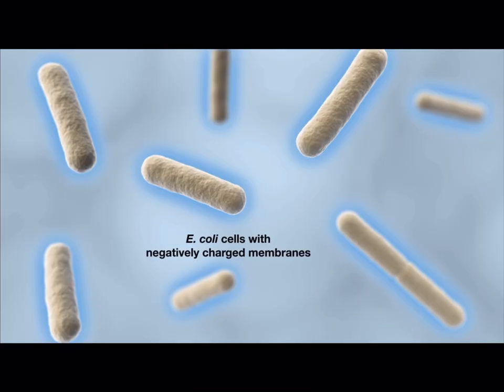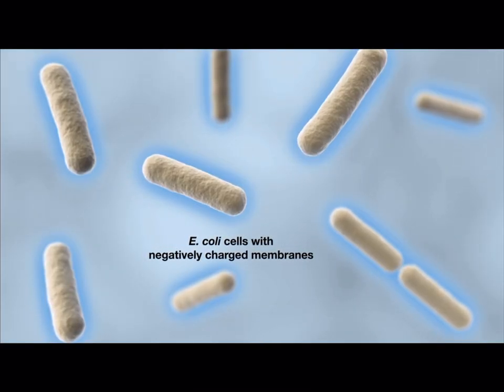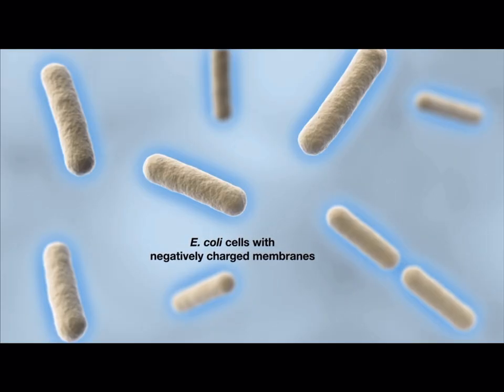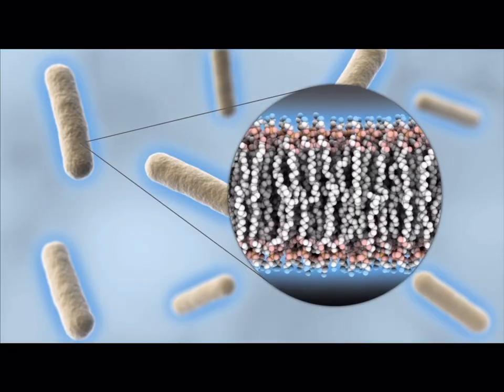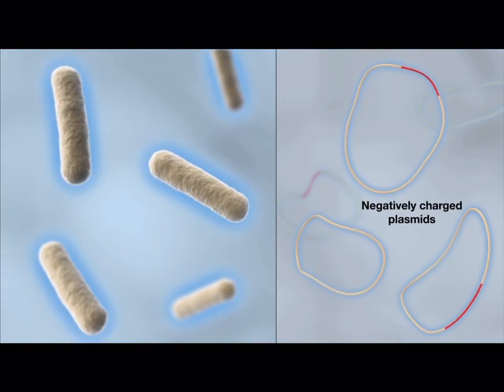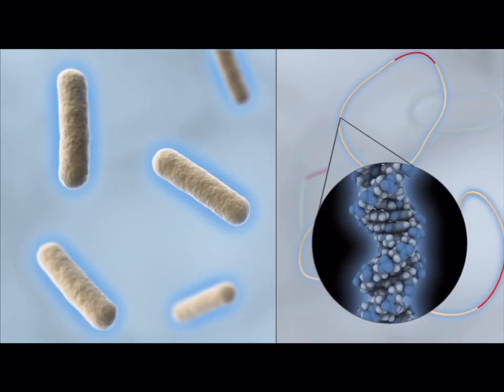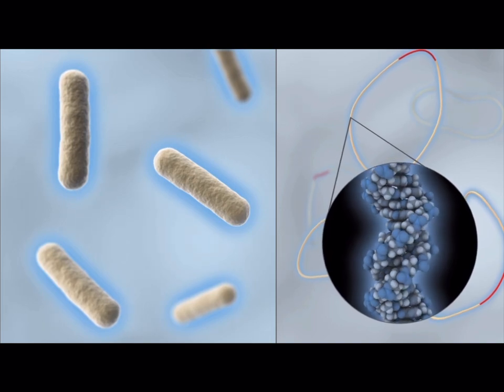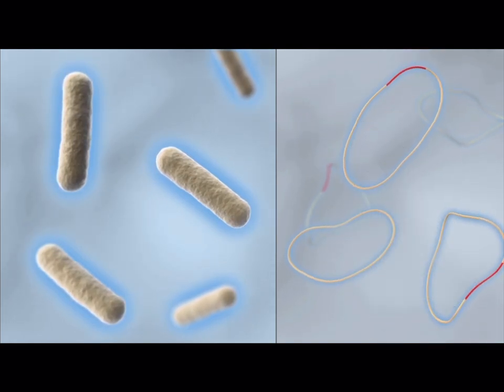The goal of transformation is to cause bacteria, in this case E. coli, to pick up DNA plasmids from their environment. The bacteria are negatively charged because of the structure of their lipid bilayer cell membrane. And the plasmids are negatively charged as well because of their DNA's phosphate backbone. Since they are both negatively charged, they tend to repel one another.